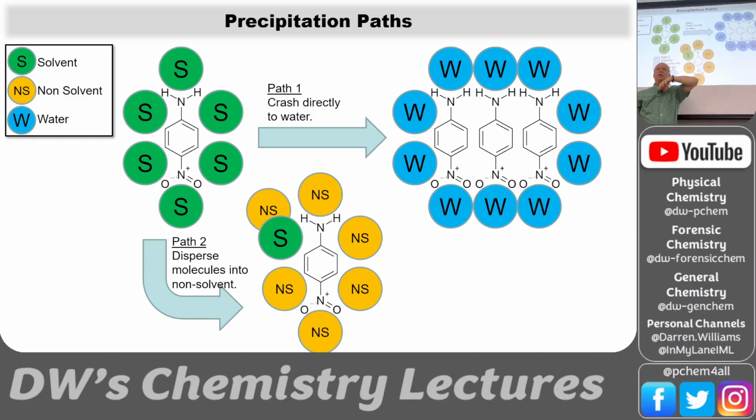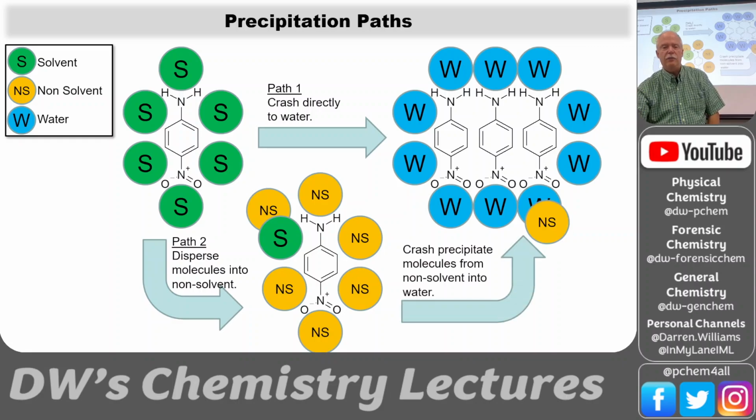Or you've got other molecules that are polar, and they'll stabilize the nitro and the aniline piece, and the crystal will grow this way. So depending upon where we go in the Hansen solubility space, we can maybe control the faces that grow, and we can get needles or plates or whatever. And then we crash it into water, okay, to just stop the process and dump it out.